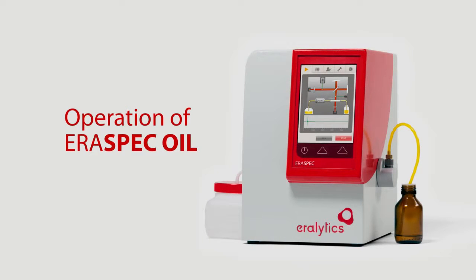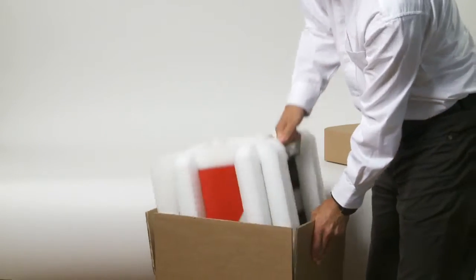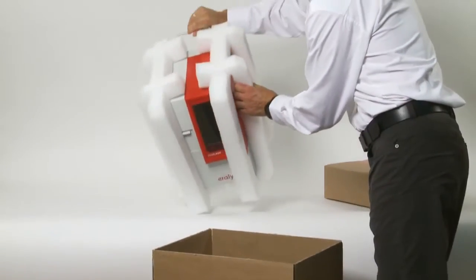Operation of ERASPEC oil. Setup. After unpacking, place the instrument on a stable bench top.